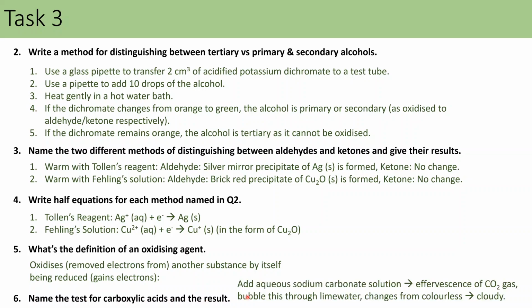Okay, so the test for carboxylic acids, or any acid for that matter, is adding aqueous sodium carbonate solution. You get effervescence of carbon dioxide gas. If you bubble that through lime water, it will change from colourless to cloudy.